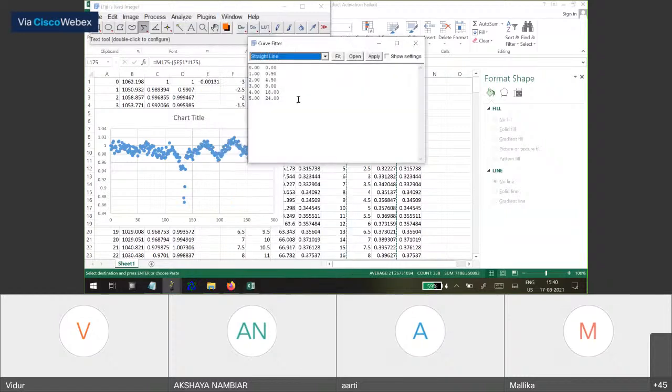Once you press this, you copy paste the values that you copied from Excel, which is your normalized intensity, normalized to the pre-bleach values as well as the amount of acquisition bleaching. So you'll get values here.